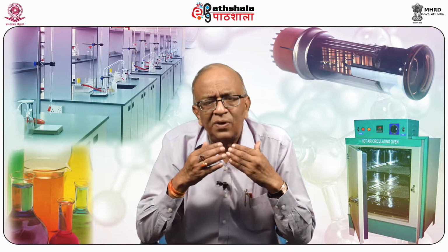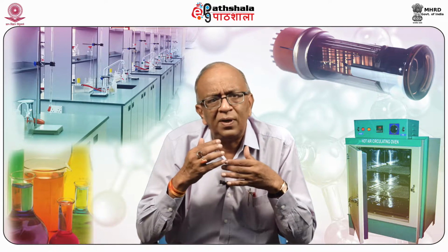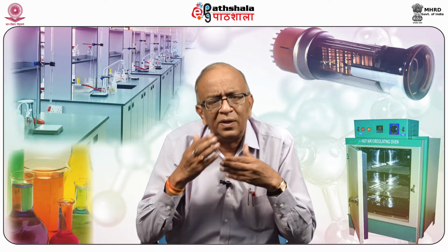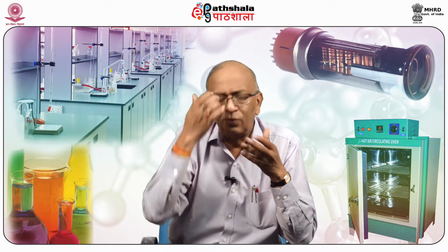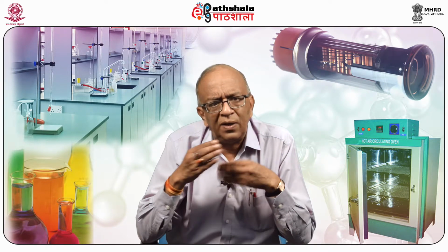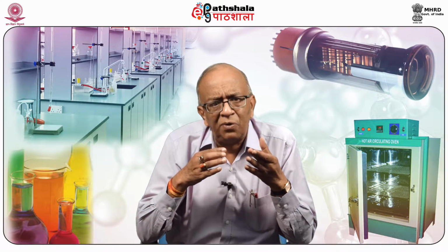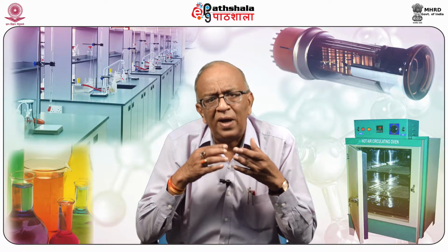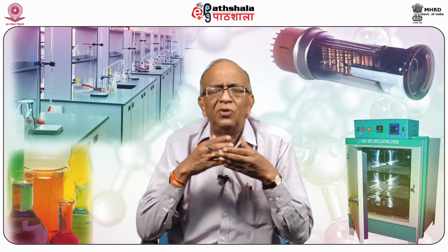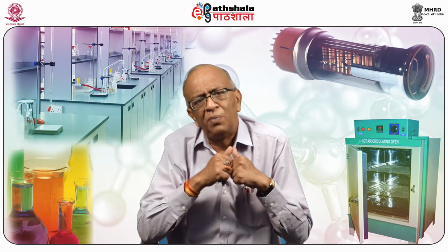By measuring the temperature at which such reactions occur and the heat involved in the reaction, we can characterize the compounds present in the material on the basis of thermal effects. The physical and chemical changes that take place when an unknown sample is heated provide information that enables us to identify the unknown compound.